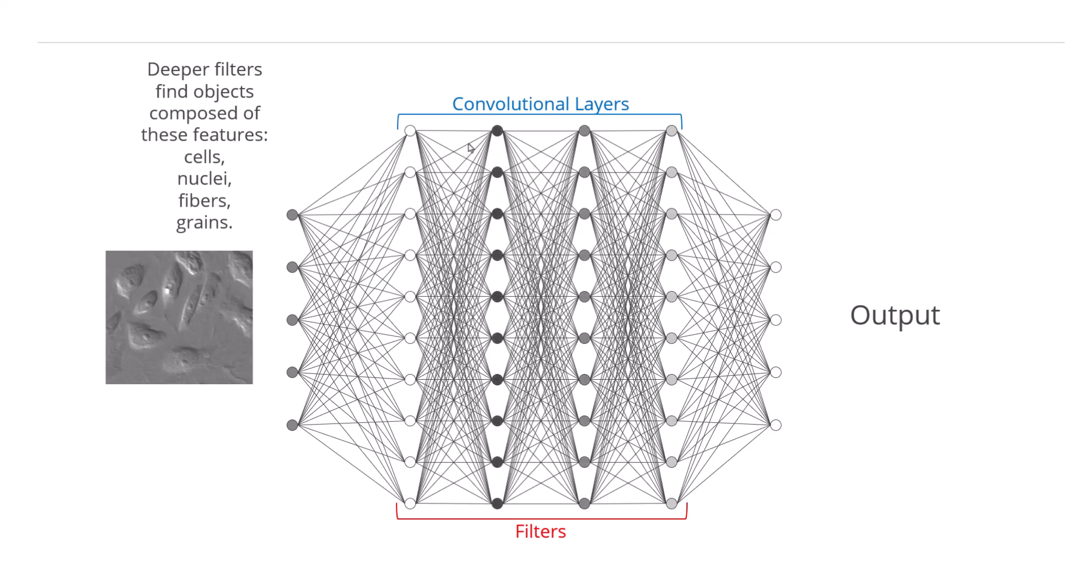Deeper filters find objects composed of these features, such as cells, nuclei, grains, fibers, or whichever features the model has been trained to find.